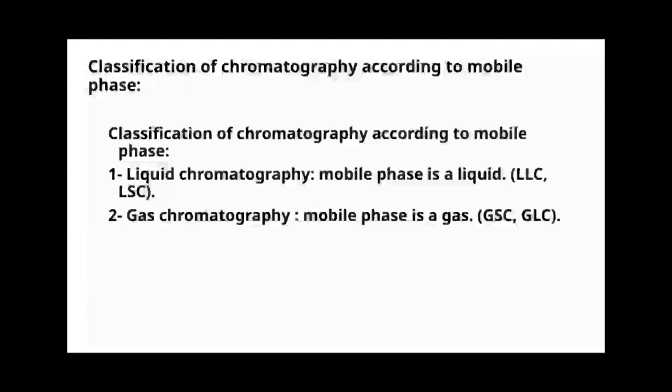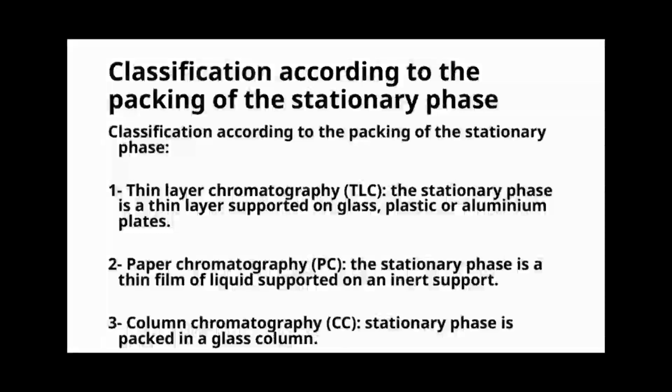Now, let's look at how the stationary phase is packed in different types of chromatography. First, we have thin layer chromatography, or TLC.